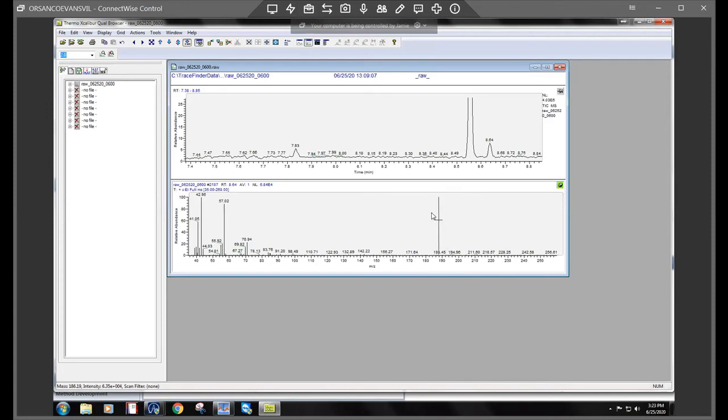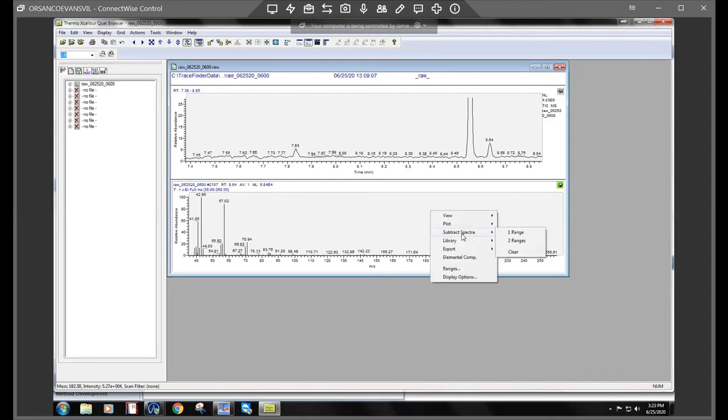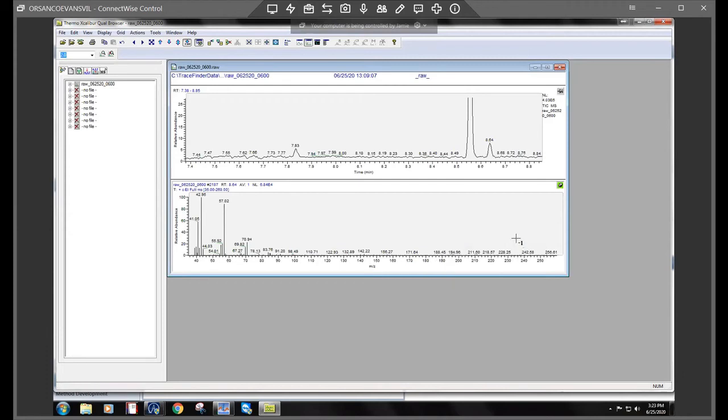So what you would do is right click in the spectra while the pin is highlighted here and you actually go to subtract spectra. And I always do two ranges. So we'll click on that.